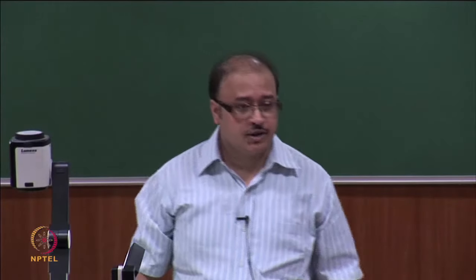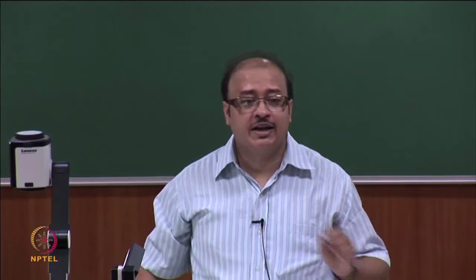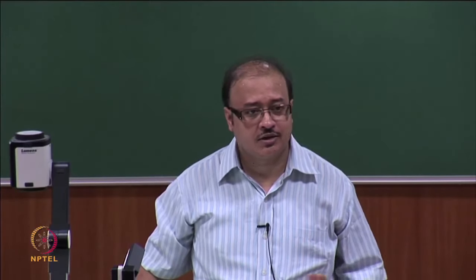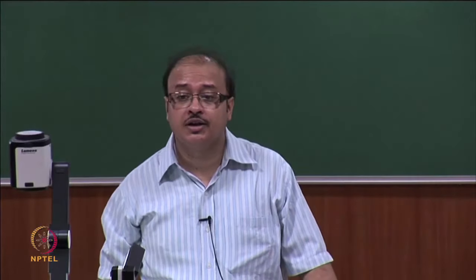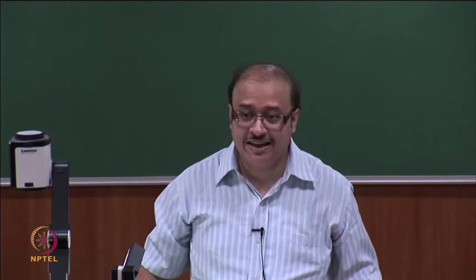Now, before ending the class, I also told you that we will be taking a break from fluorescence. That means we have done a little bit of fluorescence, and the last topic in fluorescence that I want to discuss is something known as FRET, Förster resonance energy transfer, which is very useful in studying conformations in proteins, because it looks at the distance between two labeled sites or ends.